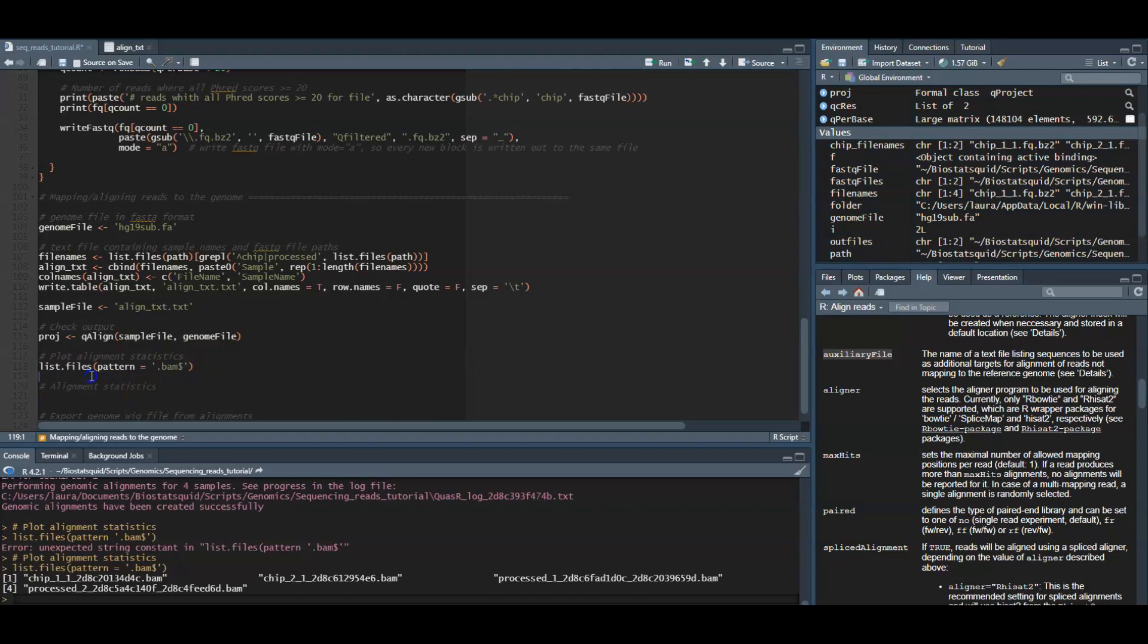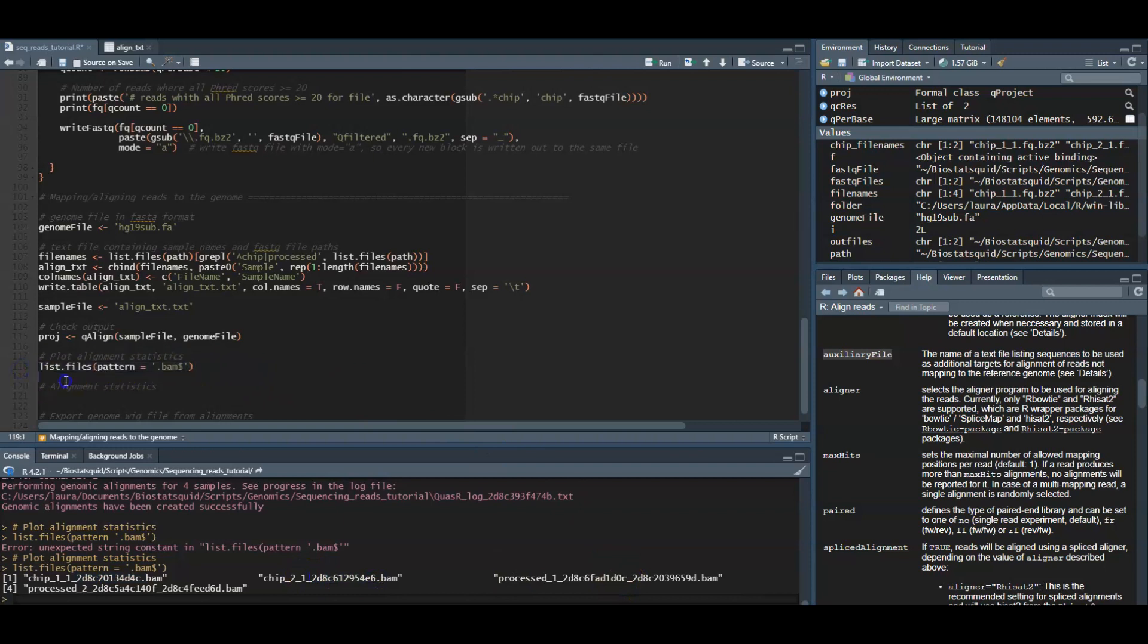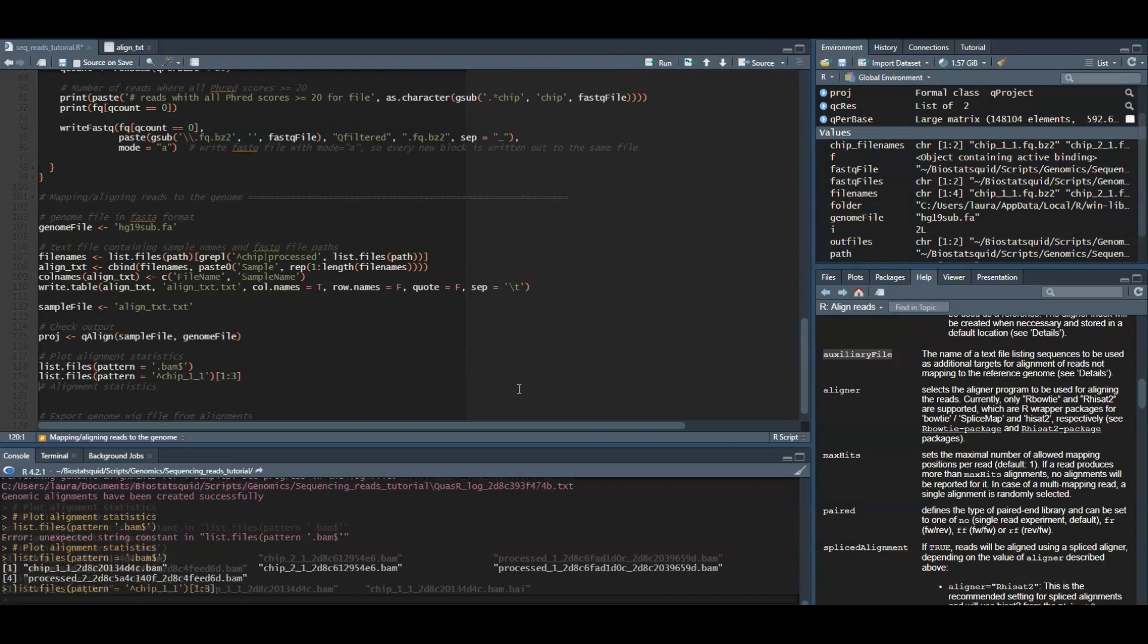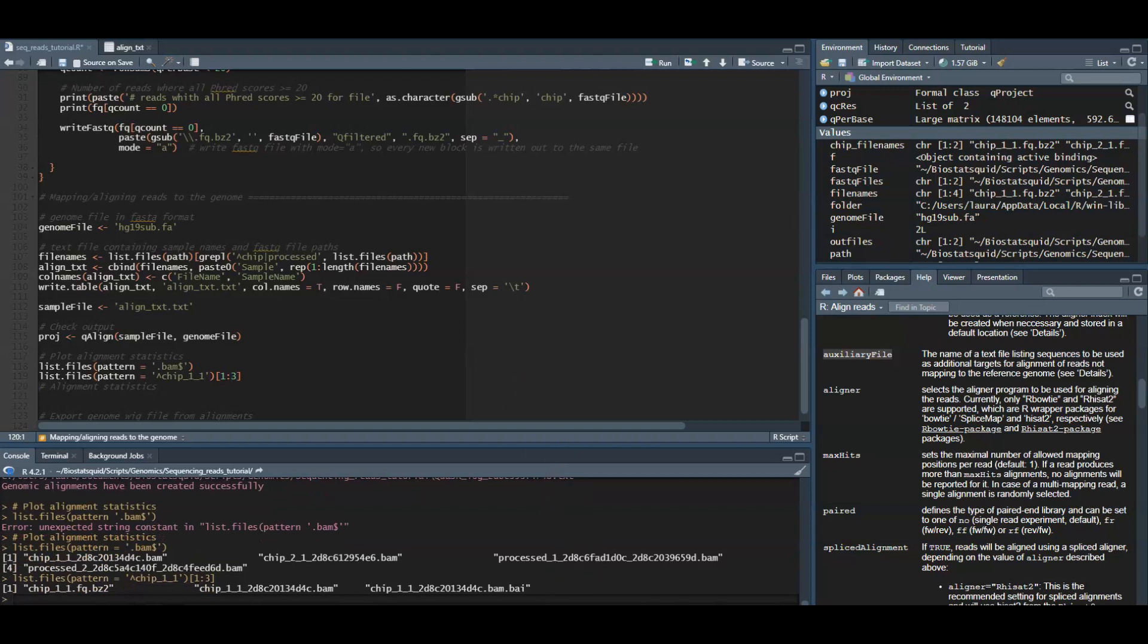The BAM file names consist of the base name of the sequence file with an added random string. What this random suffix does is it makes sure that alignment files that you generate do not override existing ones. For example, the same reads aligned against an alternative reference genome.